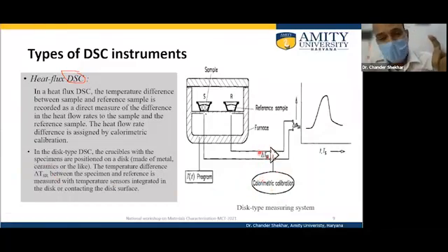Initially the temperature difference is measured, but then that temperature difference is correlated to the thermal energy flow. This process is calibration, and it is very specific to each instrument. After the calibration, the conversion of the temperature difference into the thermal energy flow is given in the manuals of the instrument, and the same is inbuilt in the software that processes the data.